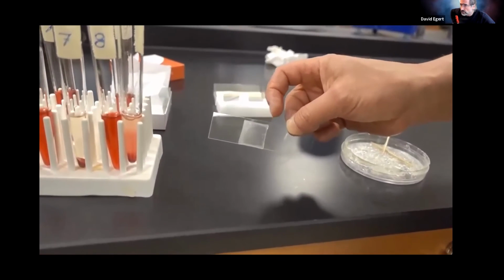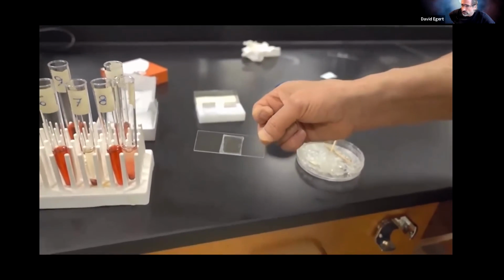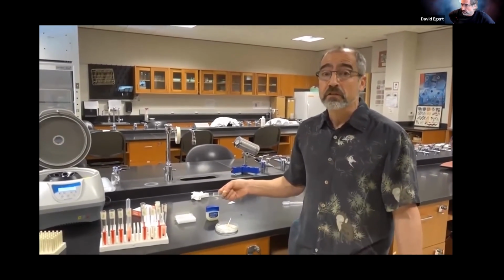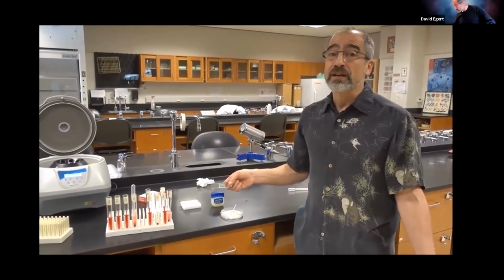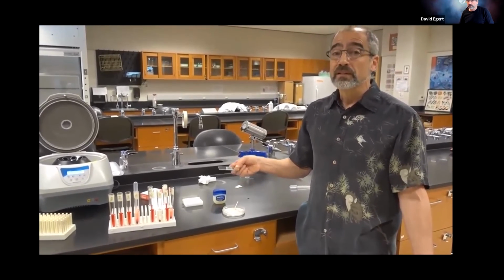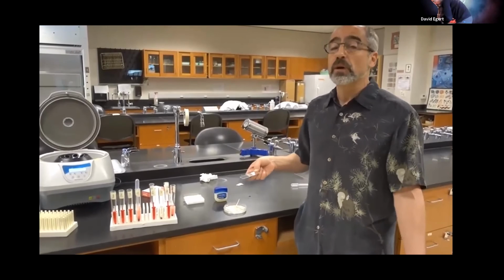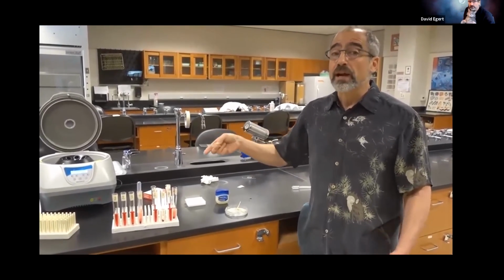The blood suspended in solution is sealed inside the Vaseline underneath there. So this can be sitting around now for like half an hour and it's not going to change. It's a bit of a production to actually do this sealing, but if you didn't, like 10 minutes from now, you'd start having salt crystals under there as the water evaporates into the room. So this allows you to have a nice slide that you can come back to and show other people as well.